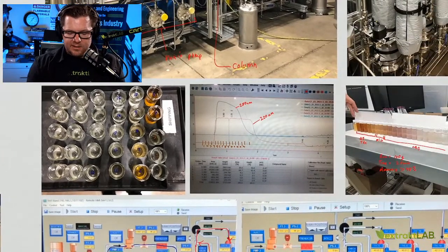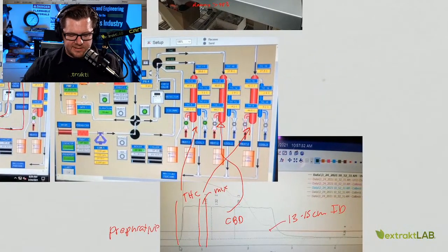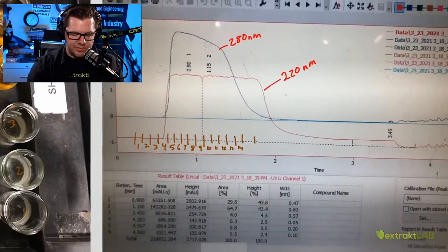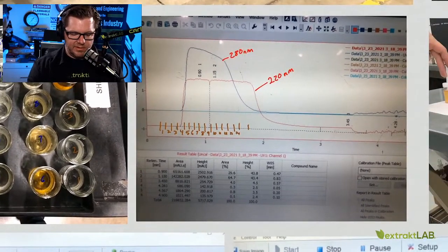So let me show you a little bit about how we go about determining where to take the cuts. Okay, and when I say cuts, I'm really talking about this. Where do I start to take my THC and put it into this vessel? And where do I stop taking the THC and start to take CBD and put it into this vessel? So we call that cuts. So let me show you the process by which we do that.